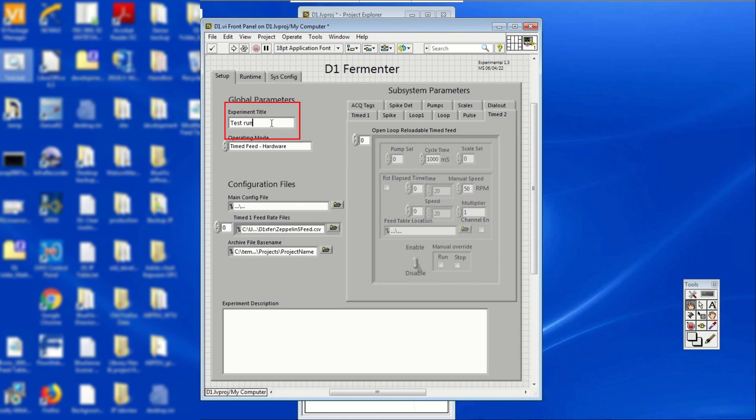Under the configuration file in the front panel, click on the experimental title bar and change the name to your own experiment or project title.